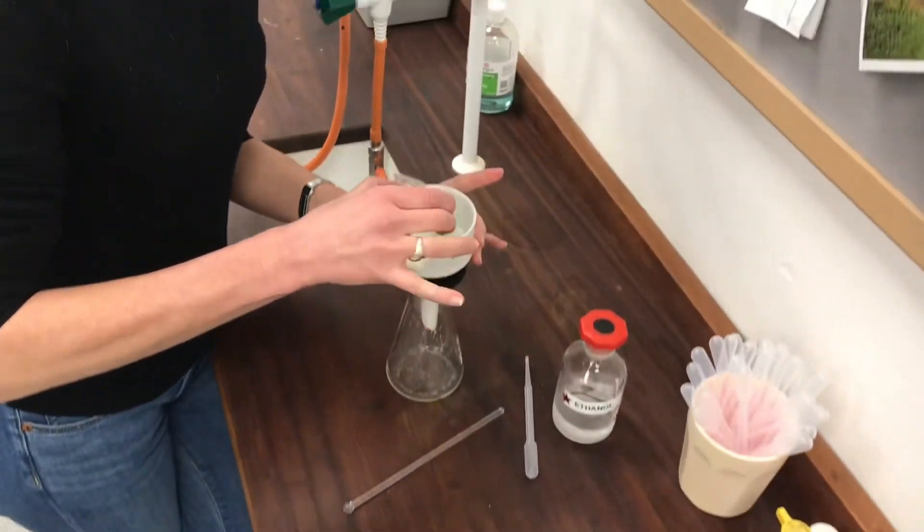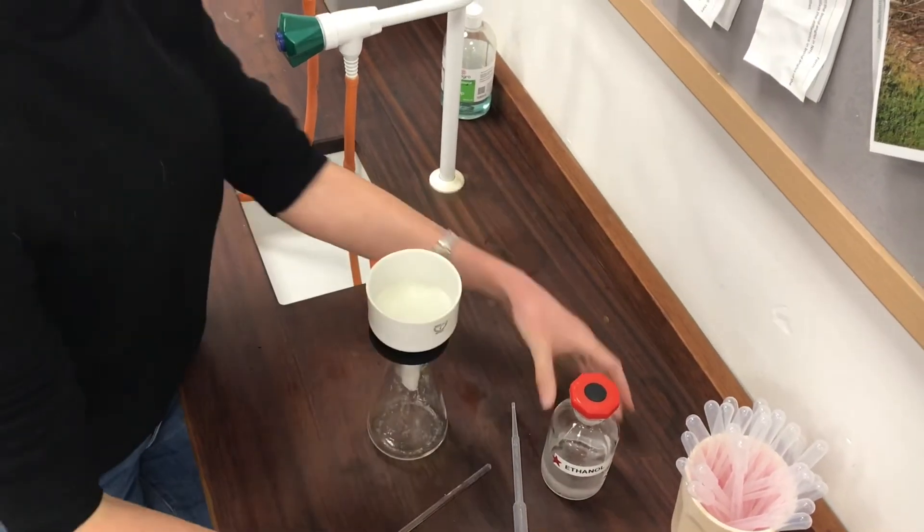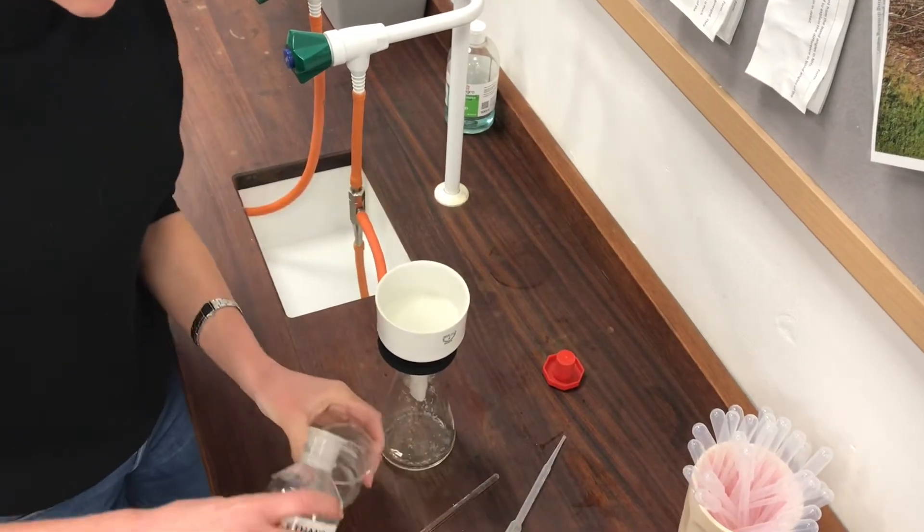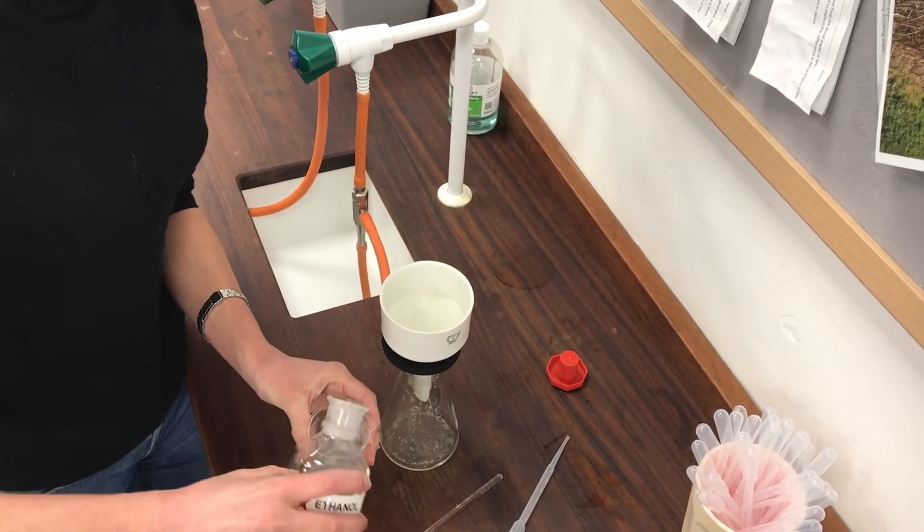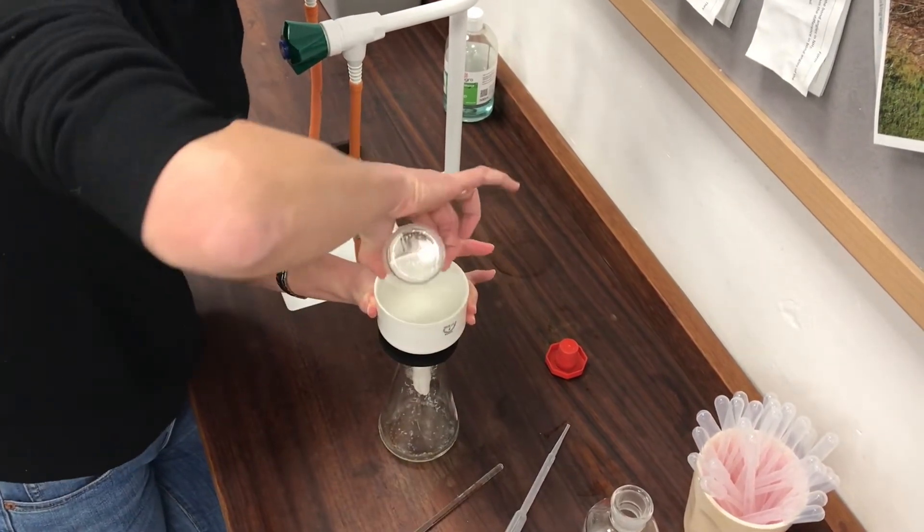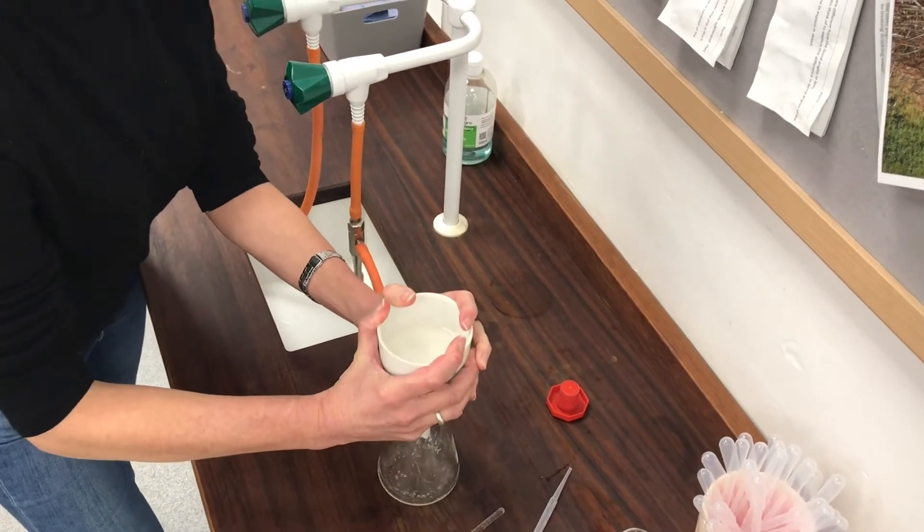Here we go. I'll use a little bit of the ice cold ethanol to swill out my beaker. Pull the funnel down to get a good suction on it.